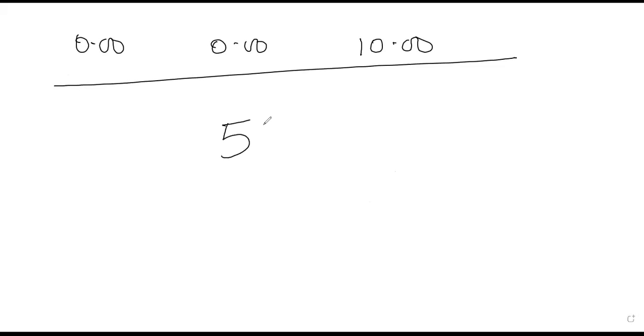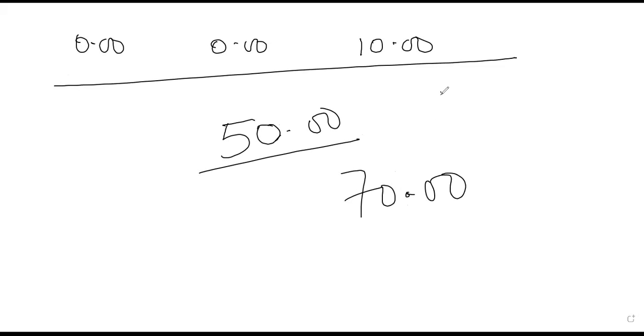The final burette reading, like what happened last year, that's why part B of the question was discarded. They didn't mark it. The final burette reading should not exceed 50 because the burette stops at 50. So if you get 70.00, like last year, it means that there was a problem. You shouldn't get a value exceeding the burette.